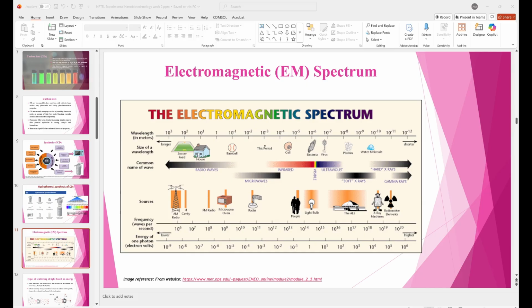Okay, you will be able to see something, but then again, it will be very blurred. It will not focus that well. So it is better to use TEM if you want to see carbon dots, because even gold nanoparticles, which are also very small in size, 10 nanometer or less, you basically see a blur. Like I have tried seeing under SEM, you do not get good images. So it is better to go for TEM.